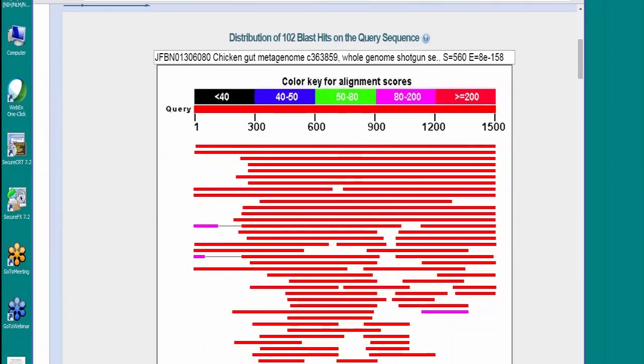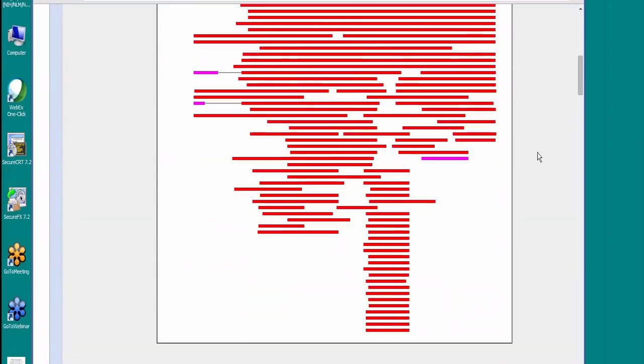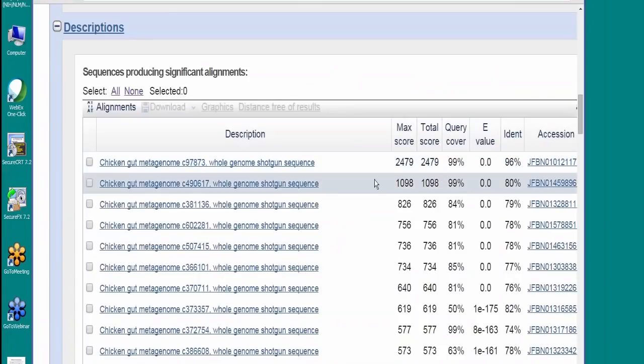So we have lots of matches to that 16S sequence. The best one is this one here. And I just want to show you something that you may find is unexpected. This sequence, of course, would only be in the whole genome shotgun sequence database if you searched it on the BLAST homepage. This is a much more convenient way of doing that. We have to treat the WGS sequences differently than we treat other sequences. They're not really a part of the Entrez system directly.